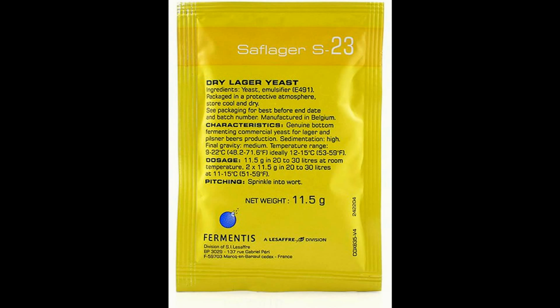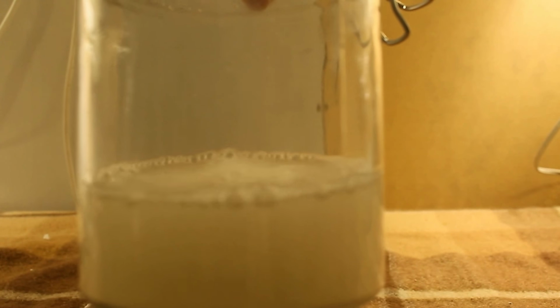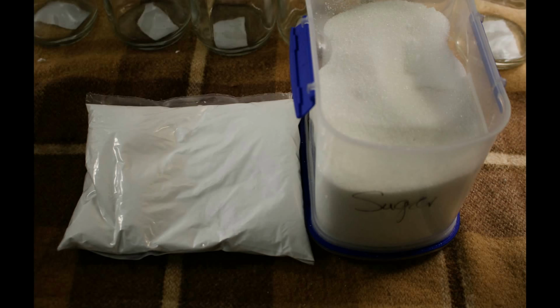Stir to dissolve everything. This starter culture will be done in the cold, and so having a large volume of yeast on hand is useful. Stir, or in this case swirl your container to make sure everything is mixed thoroughly, and to ensure that all of your sugar and nutrient is dissolved.